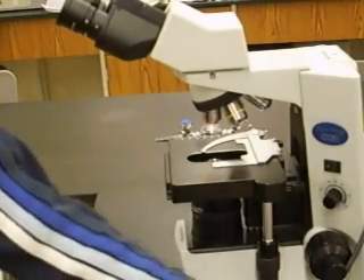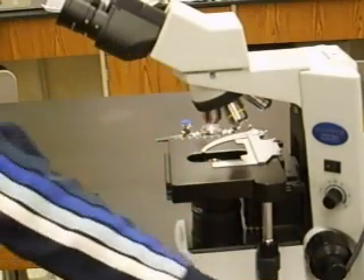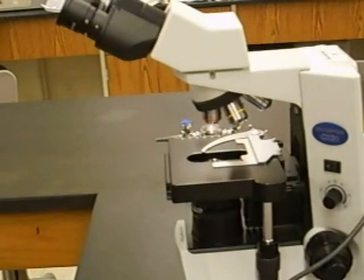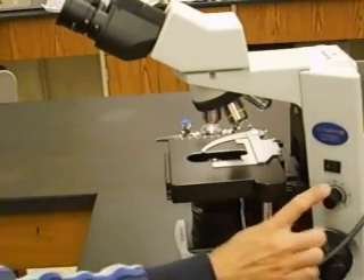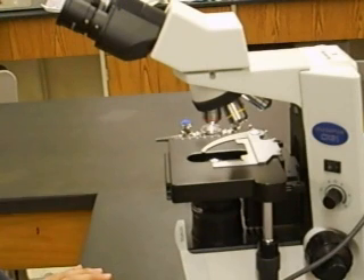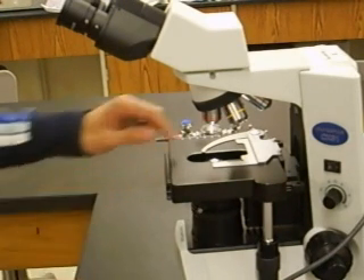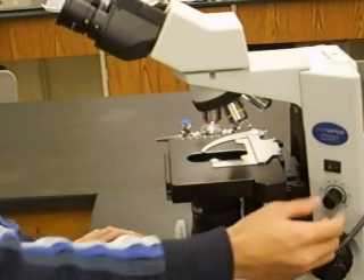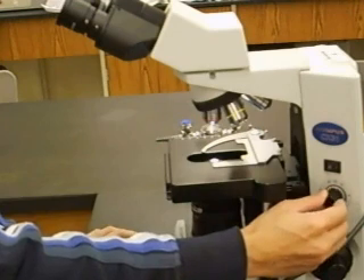When you're ready to look at a specimen, plug in your microscope and turn on the light. The light switch is this button right here. When you turn on the light, you should see it coming up from the bottom. You can adjust the intensity of the light by turning the knob left or right.